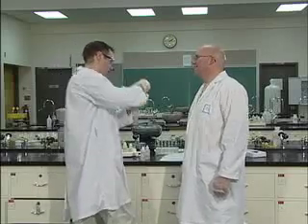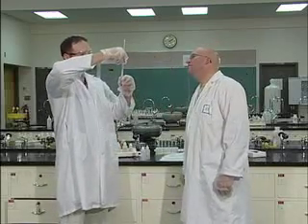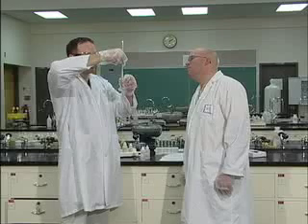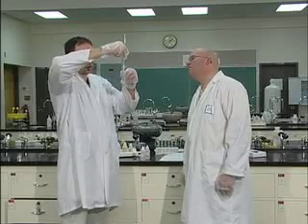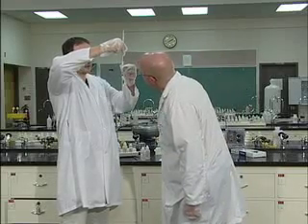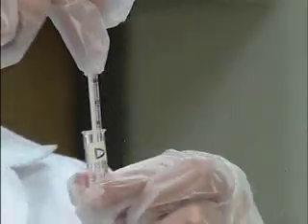And the other thing we're going to do is take the temperature change again. We're going to try and find the final temperature. And again, for this one, it might change a little bit. In fact, it is going up probably 2 or 3 degrees because you're adding a strong acid to a weak base. But for the most part, you will also notice there's a little bit of fizzing, some bubbles forming. And of course, your solution has gone back to being clear.